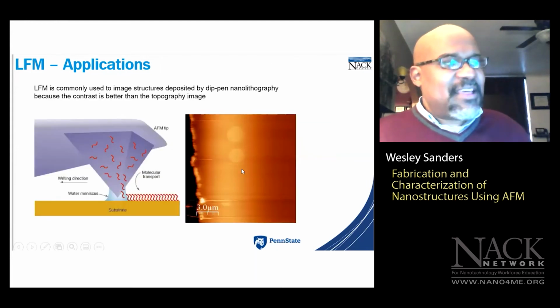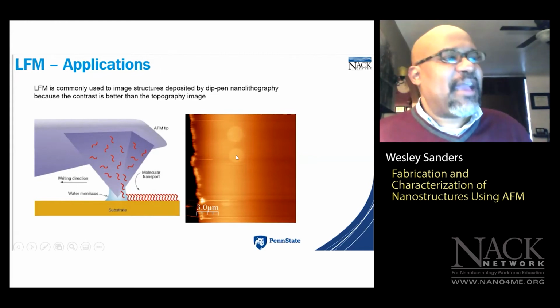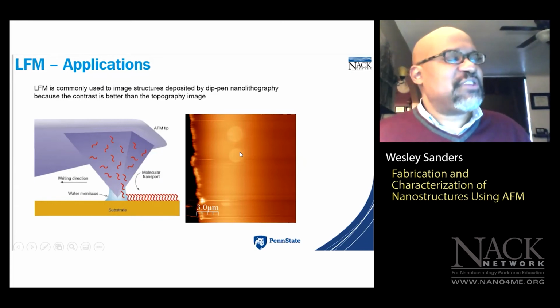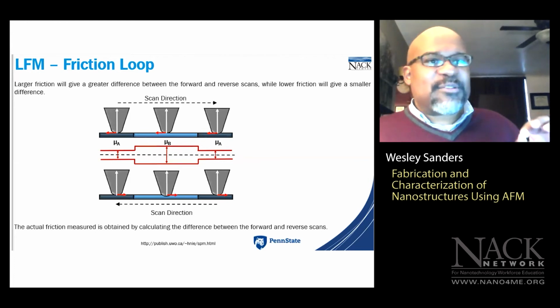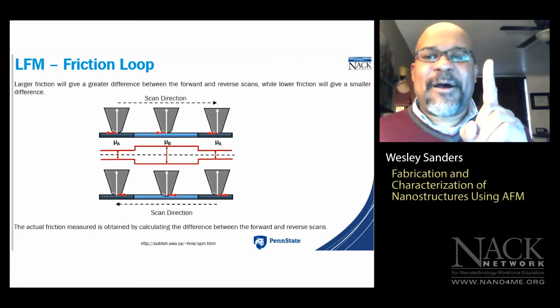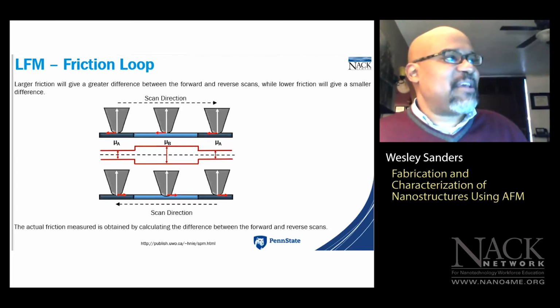So I believe I showed you this image before. This is an LFM image of alkane thiol dots printed on a gold surface using dip pen nanolithography. So really quickly, I want to talk to you about the frictional loop because I need to talk about one other AFM technique before we get to Glen's demo.